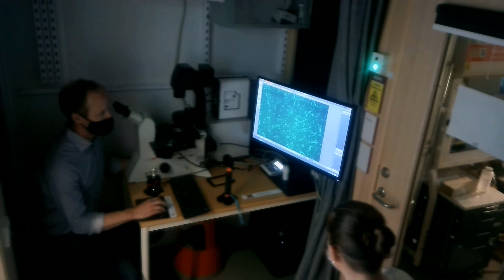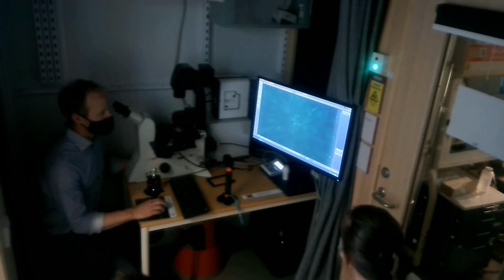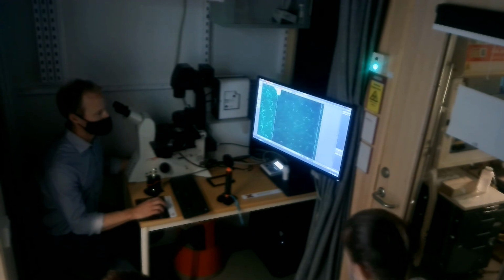Once I find something, okay, so over here, this is what I want to look at, for example, I can double click here. The stage would move there. It would also take a picture. Just overlay that. Change that a little bit brighter. So now I'm in this position. You can see always where I am with this. If I scroll out to see more, I can always quickly go to my field of view by clicking on this one, move to stage position. That will sort of maximize this one in the window.